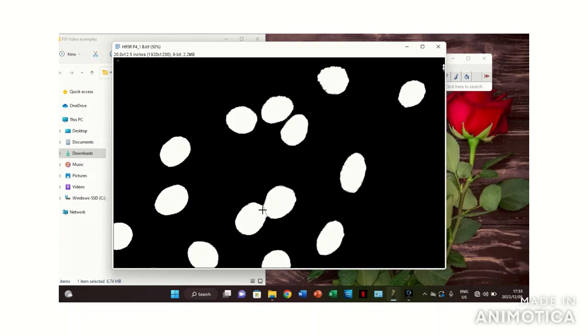Imagine bodies of water sitting next to each other, and as they fill, the two bodies of water would touch at a certain point, indicating that this is the end of the two bodies of water. The watershed function works the same way. Imagine the two cells are being filled with water, and as soon as the two bodies of water touch, it indicates that it is the end of the cell. Once you are able to distinguish between your cells, you can thereafter process your images further.